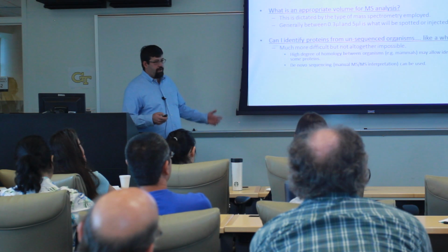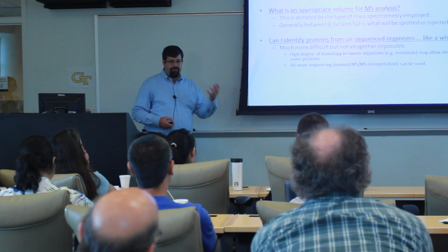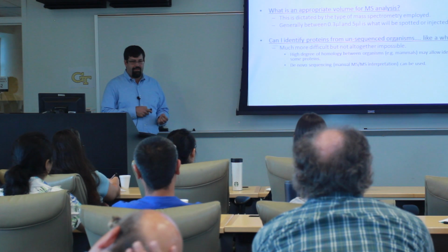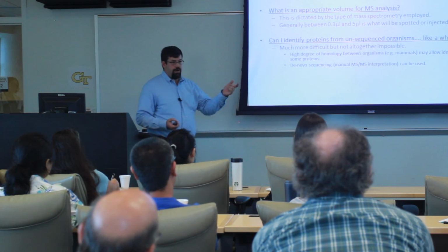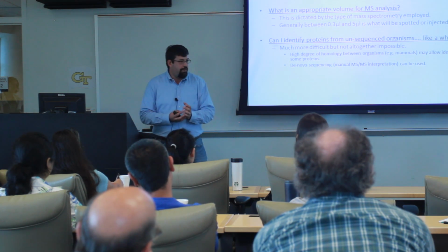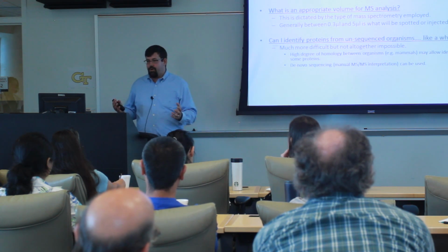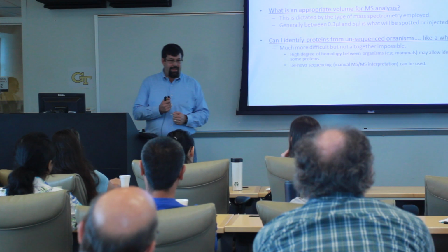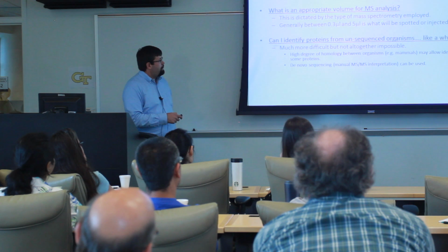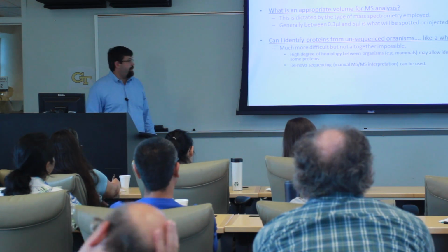What is an appropriate volume for MS analysis? Somebody asked me this the other day. Well, if we were going onto a MALDI plate, for instance, we might have our purified peptides, and we would spot, say, 0.3 microliters of that. So think about that. If you ended up with a volume of purified peptides of a mil, and you started with 5 nanograms of protein, you're not going to have much material in that 0.3 microliters. But that's really the volume we're at for a MALDI-TOF mass spectrometer. We'll go up to 5 microliters when we're injecting onto an LC system that goes directly into a mass spec.